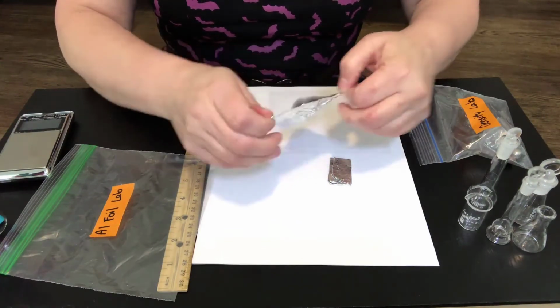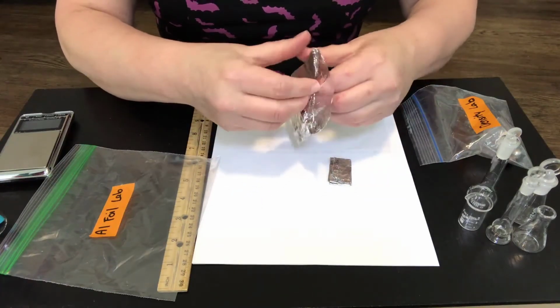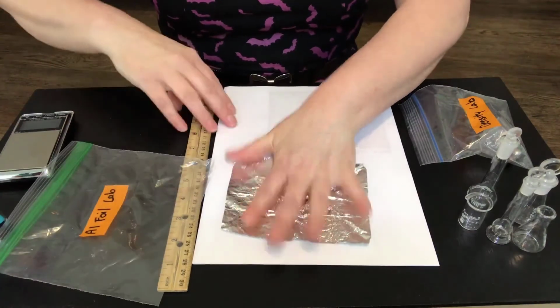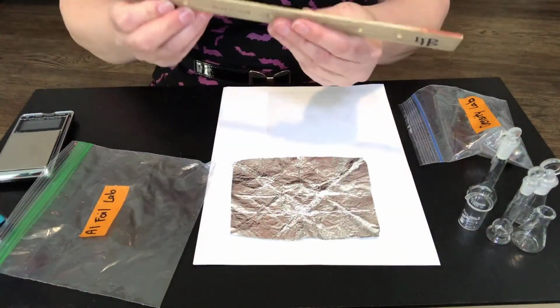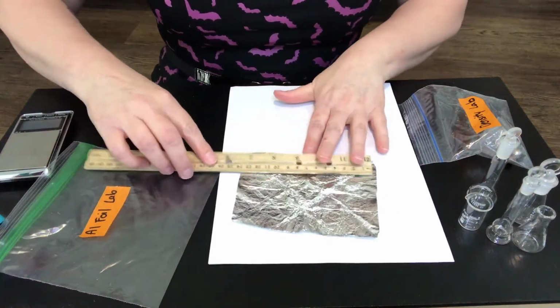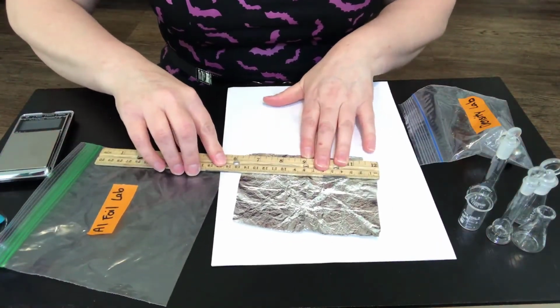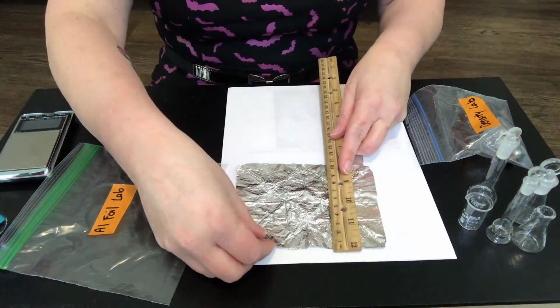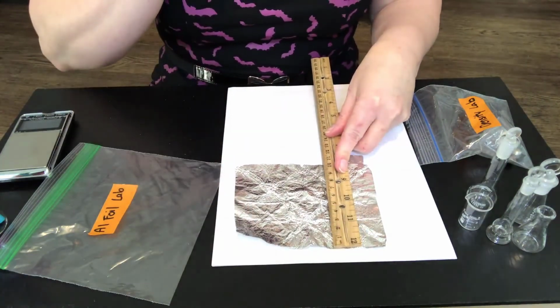And remember that for each of the pieces of aluminum foil, we measured in centimeters the length of the aluminum foil, and then we measured the width of the aluminum foil.